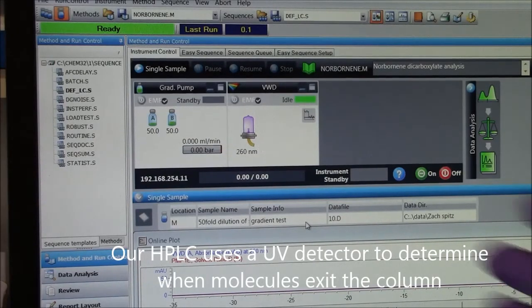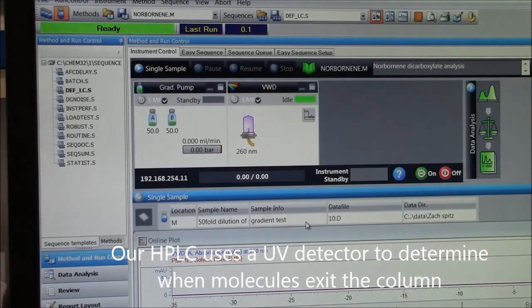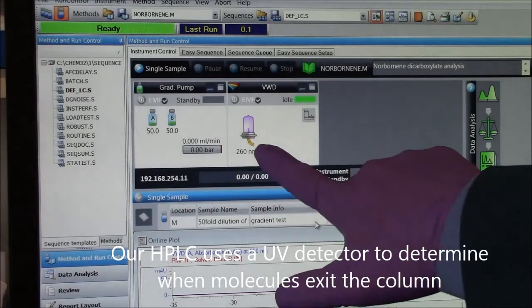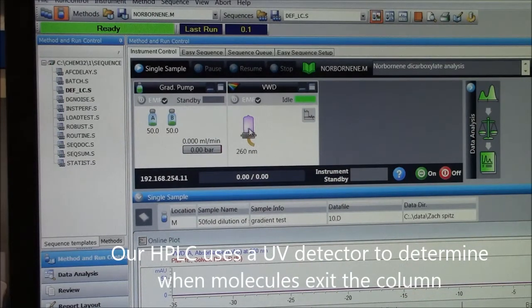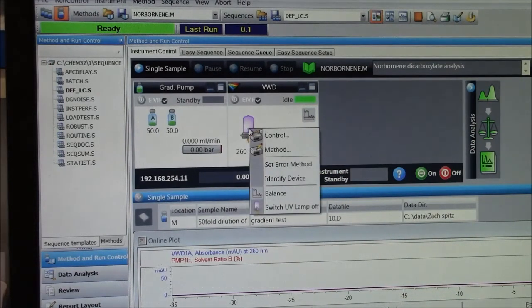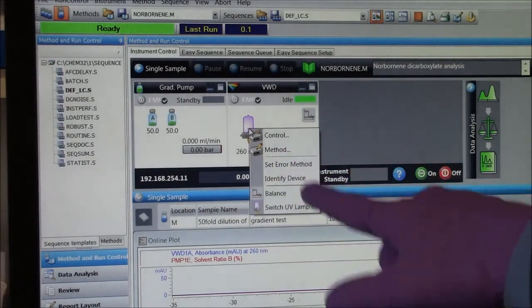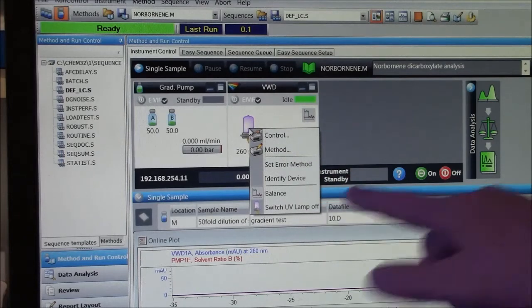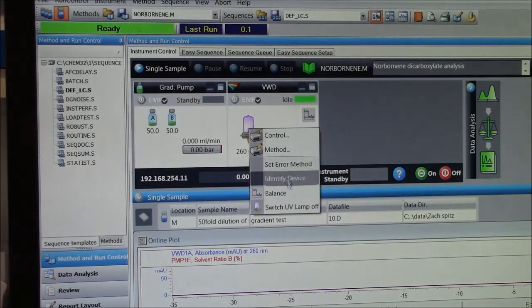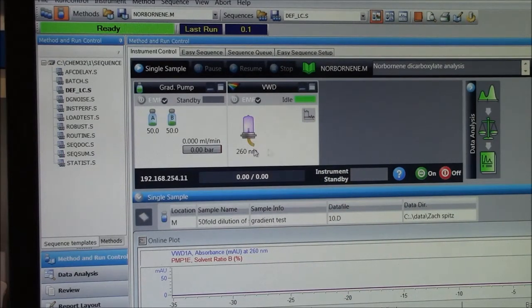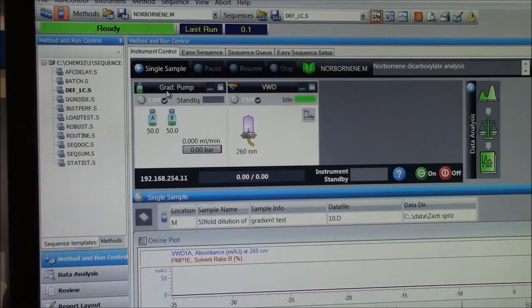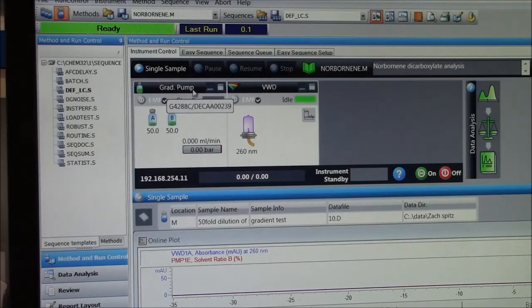On the computer now, I can see my UV lamp is on. If it were off, I would do a right-click, switch UV lamp on, is what it would say. The other control here is for the pump, you see gradient pump.